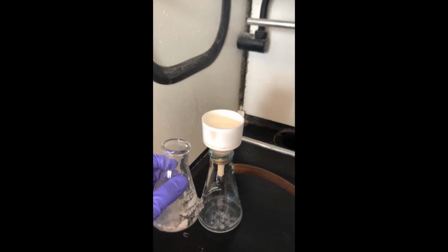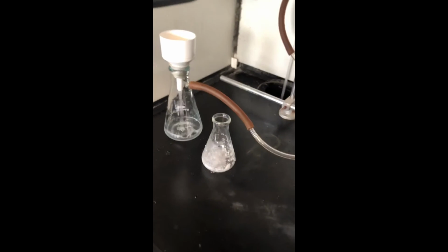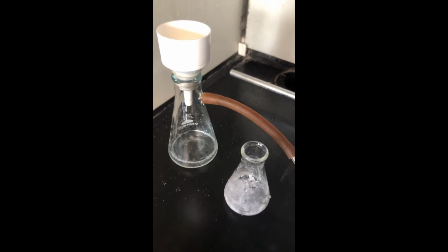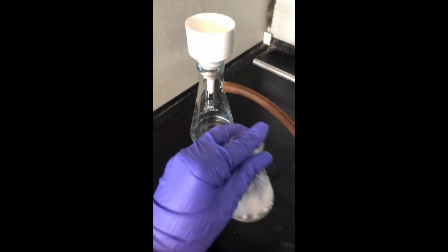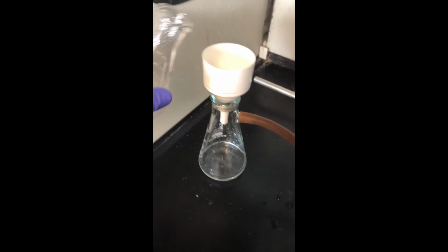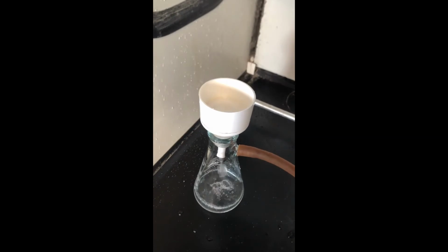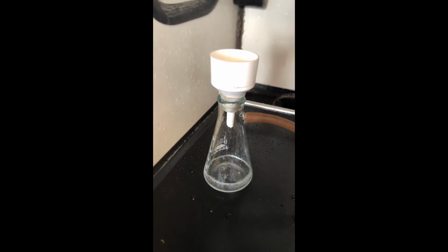I additionally rinsed my flask with some more DI water to make sure that all of that solid product wasn't clinging to the sides of the flask, but instead was being dumped out onto my filter paper so that it can be isolated and I can use it for my workup at the end of my experiment. Again, this was just for the purpose of the video, but usually you'd be isolating that product so that you could mass it or analyze it in a different way to make sure that your reaction happened in the way that you thought it was going to.